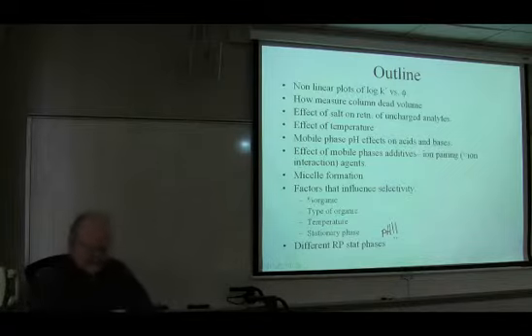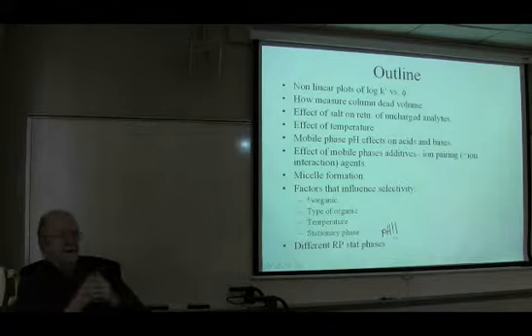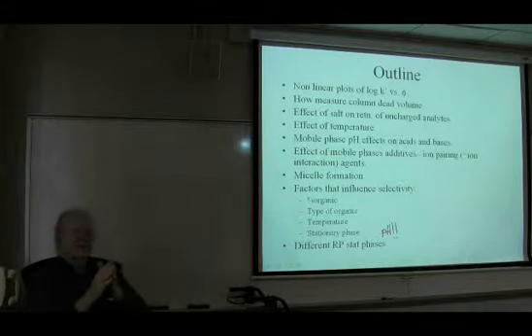One or two more comments about what you mix with water. Since more often than not, the detector that we use in LC is a UV visible absorbance detector, you don't want your organic solvent to absorb light in the UV or visible range. That means that you have to work above a certain wavelength.